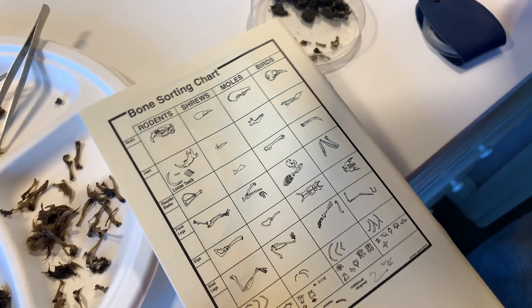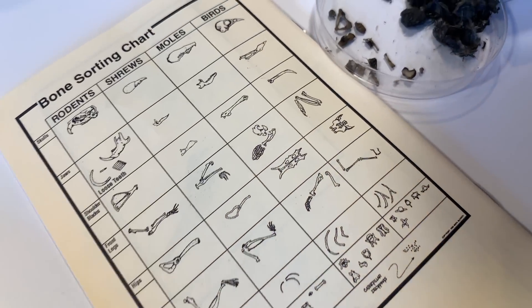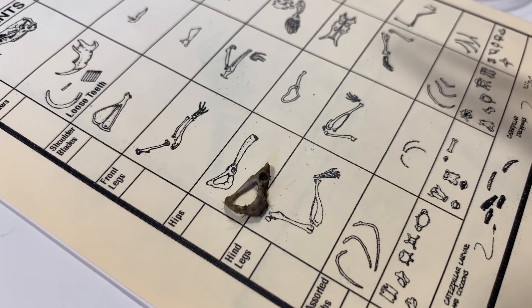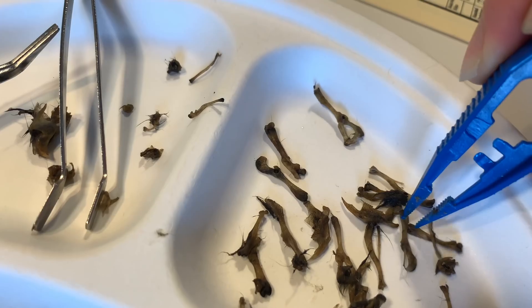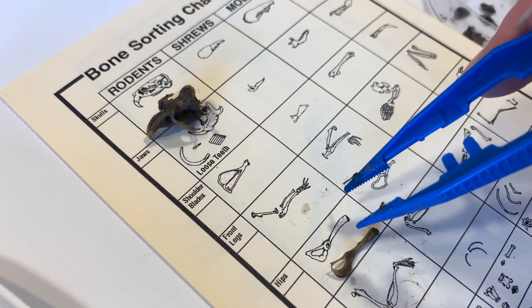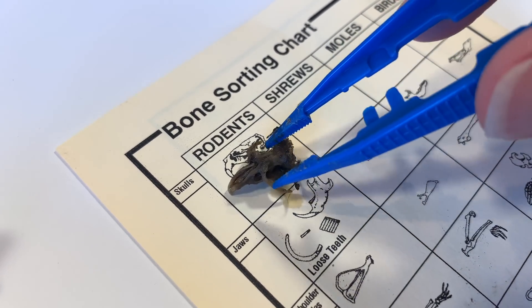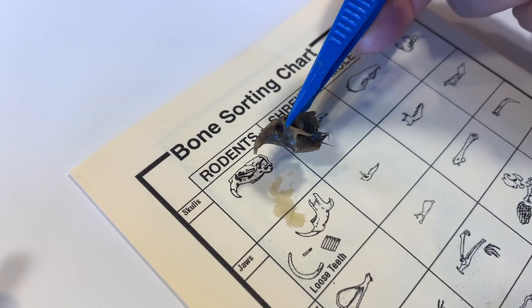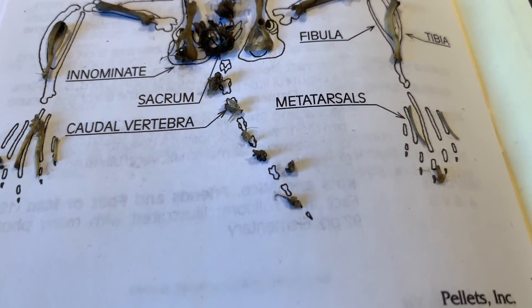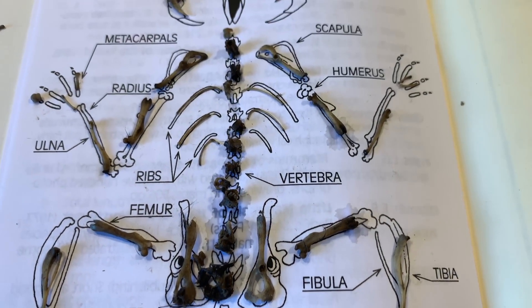At this point we want to identify some of those bones and try to figure out what kind of animal our owls have eaten. Once we put them down on a little chart we kind of had an idea — it was really fun identifying all of these bones. We were able to figure out what kind of animal our owl had eaten, and when we opened up the field guide we got to see all the bones laid out, spread out like a skeleton.